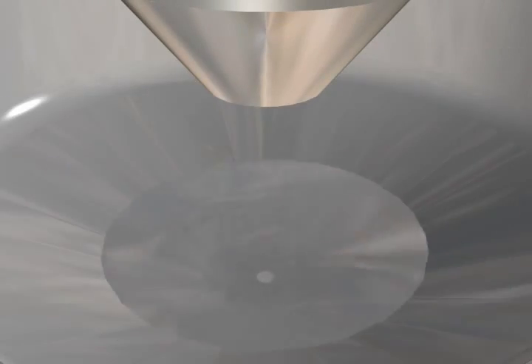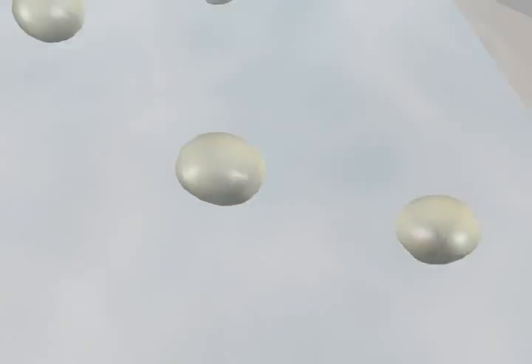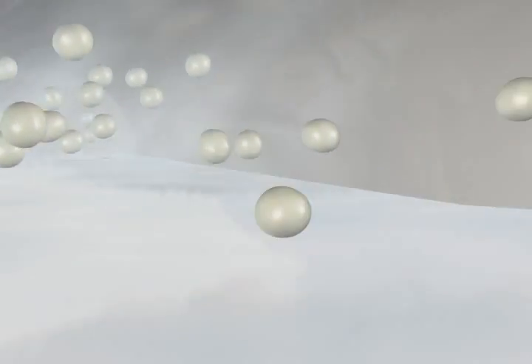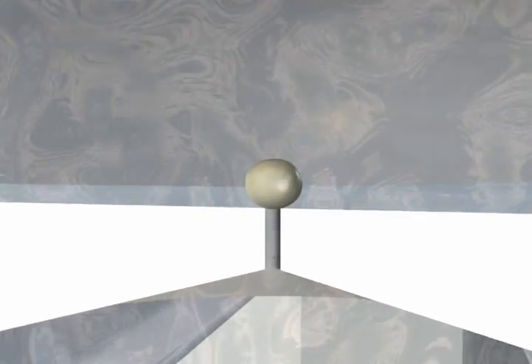The cells are applied to each inlet well and drawn into microfluidic tunnels, where a single cell is pulled into the patch clamp hole by suction and the planar patch clamp process begins.